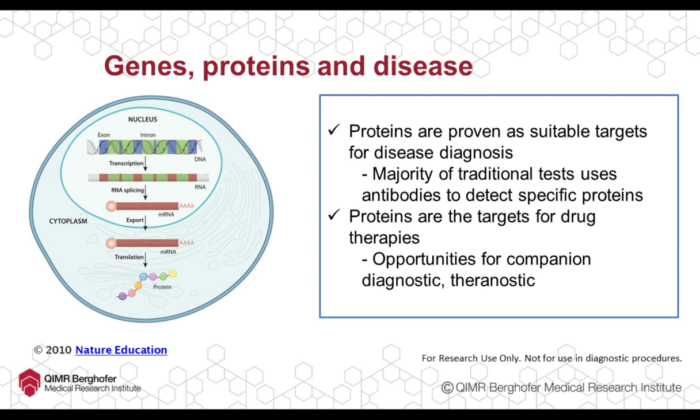So firstly, before we dig into the details, let's have a brief consideration on why we want to do clinical proteomics research. We all know that genes make proteins, and there are many different techniques now that enable us to measure the genome and the transcriptome, and they are well used. So is there really a need to directly measure proteins? Well, actually, yes. Proteins are the direct disease targets for diagnostic tests as well as for therapies.